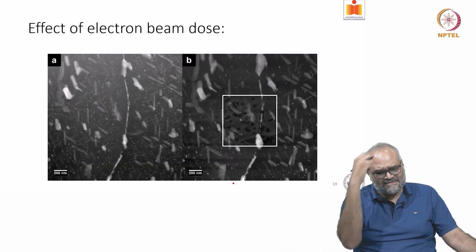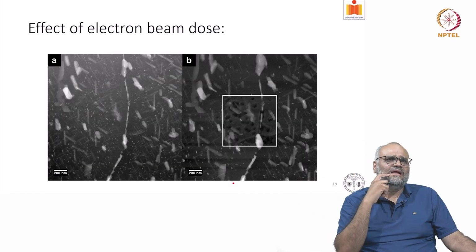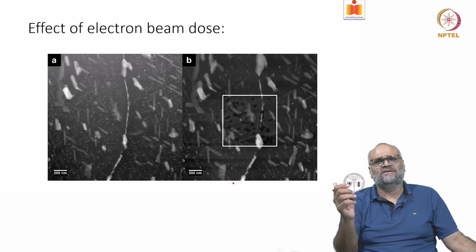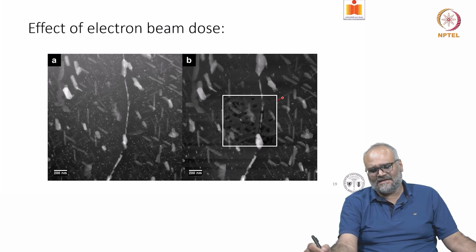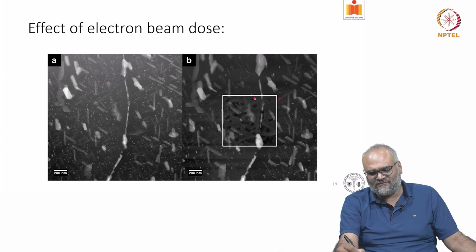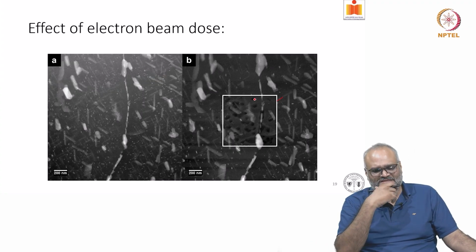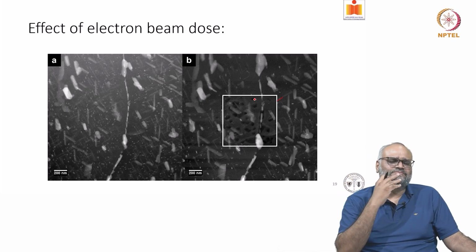The answer is, it certainly does affect your specimen, and you can see that in this particular case, when we are trying to obtain EDS maps from this region, beam currents as low as 35 nanoamperes, or depending on how you are describing it, as high as 35 nanoamperes, can start forming holes within this aluminum specimen, which is about 150 nanometers thick.